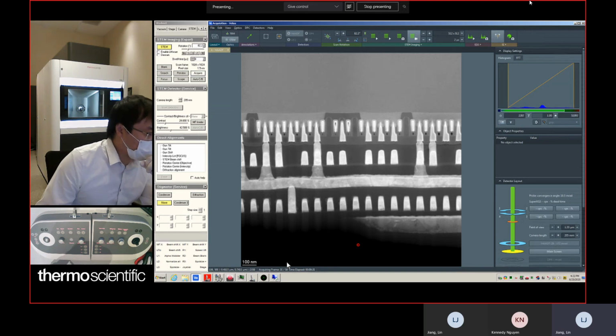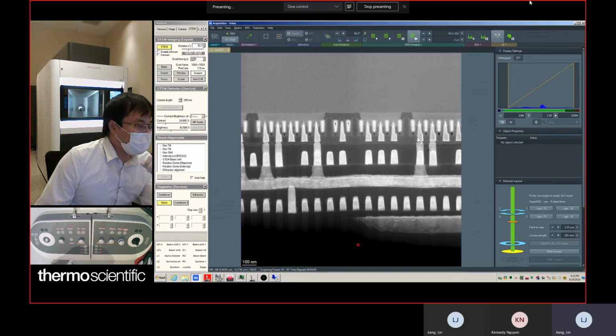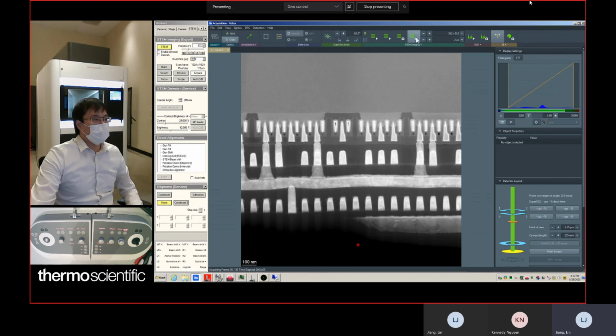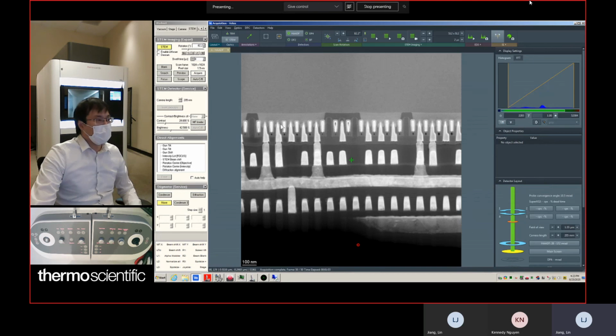So when it reaches the 50 frames, it's gonna only keep the most recent 50 frames. So you can take the processing. And now we have 46, 47 frames. Once you reach 50, it's only gonna loop the most recent 50 frames. So when we start, we just take all the data, and we only have 50 frames.